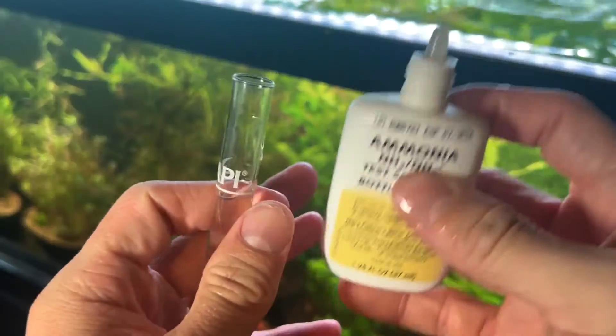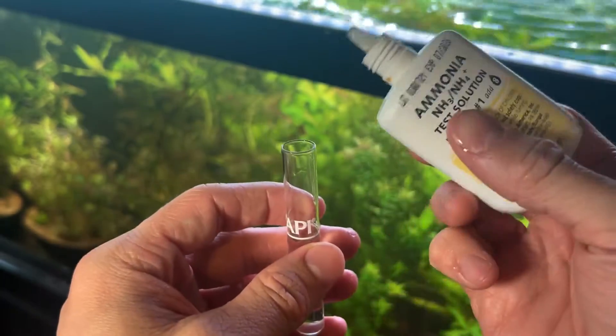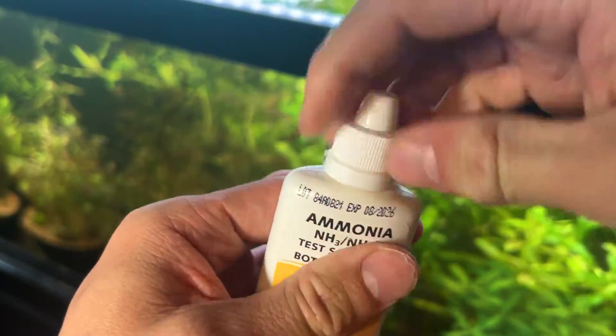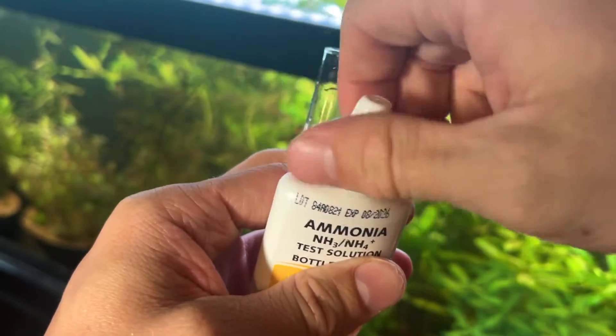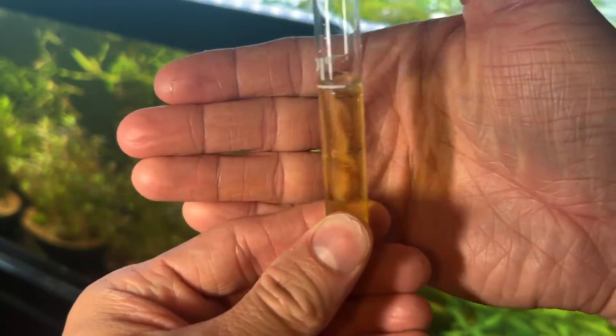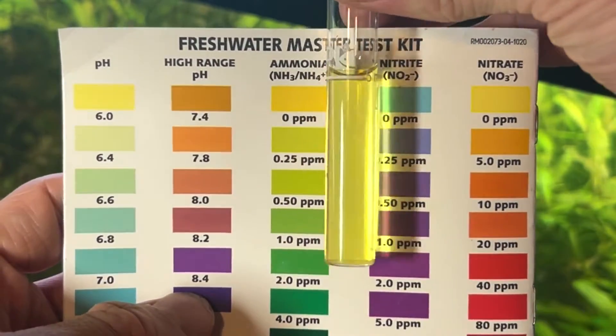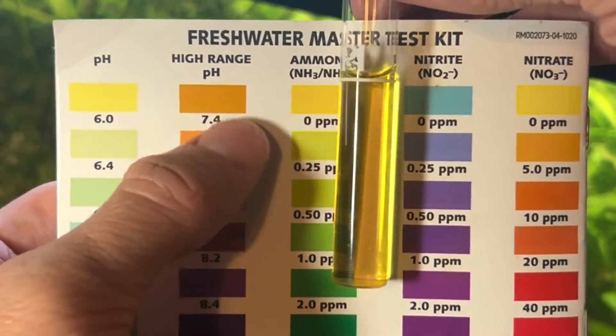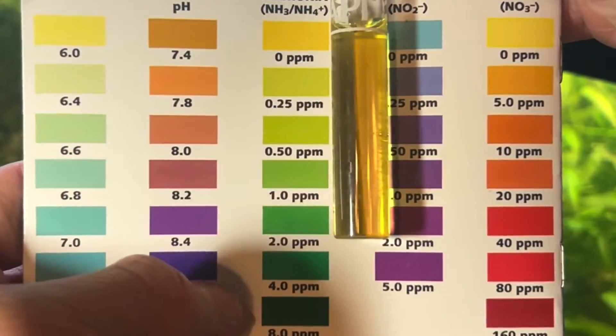Now let's test our ammonia levels. When it comes to ammonia, we want very little to zero ammonia in our aquarium, as ammonia will harm our fish. To reduce it, you can add live plants and do more frequent water changes. Fill the test tube, add eight drops of ammonia bottle one, give it a good shake, then add eight drops of ammonia bottle two. After another shake, testing the result, we're shooting for zero parts per million — and it looks like we got it. If ammonia is too high — anything past the yellow and light green marks — do a water change.